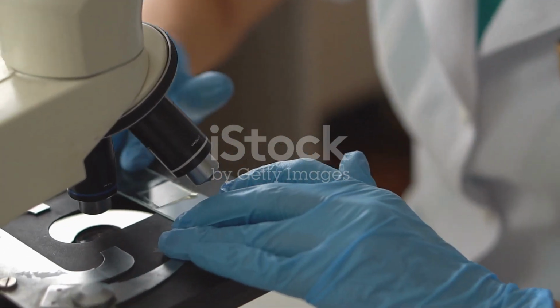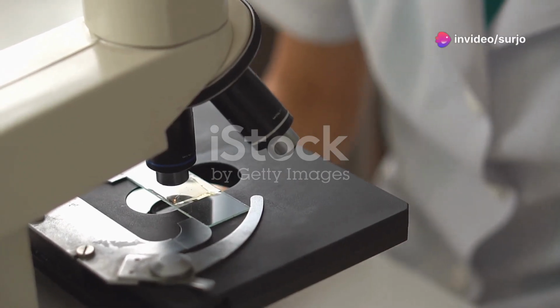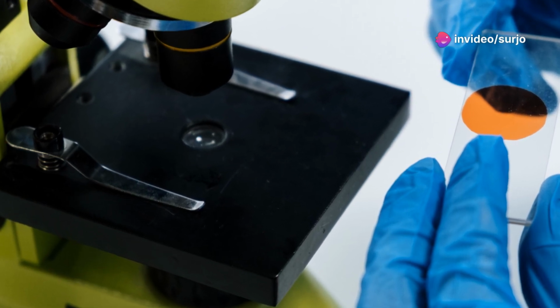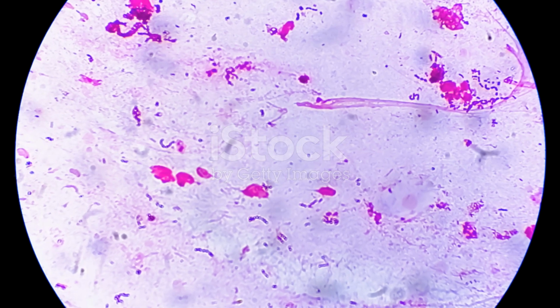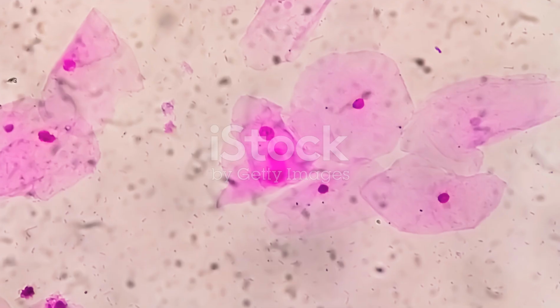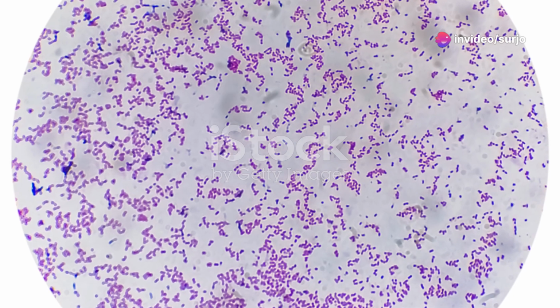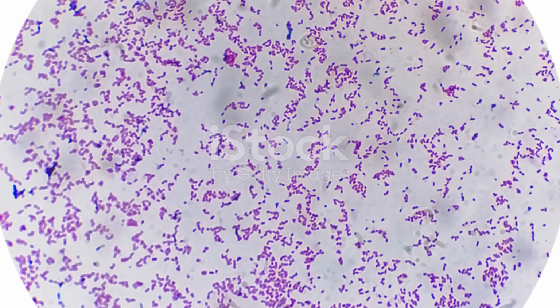The Gram stain, a fundamental technique in microbiology, differentiates bacteria into two major groups, Gram-positive and Gram-negative. This distinction, based on the ability of bacterial cell walls to retain crystal violet dye during the staining process, reflects fundamental differences in cell wall structure, which have profound implications for bacterial identification, treatment, and pathogenesis.